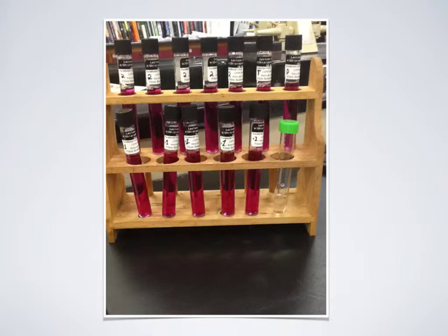The D and T labeled vials stand for distilled water and tap water, while 5 of the vials are labeled number 2, meaning that they came from a different source than the other 5 vials labeled number 1. The vial with the green cap on it represents the water from the lake. The vial labeled D stands for distilled water, and this picture is taken before the incubation process. The vial labeled T stands for tap water, and this is also taken before the incubation process.